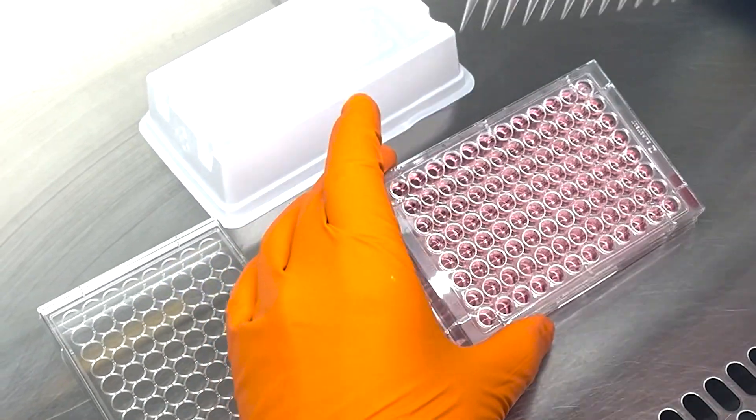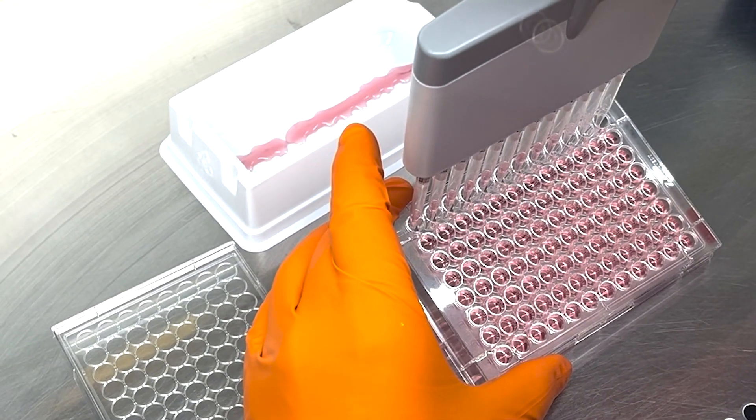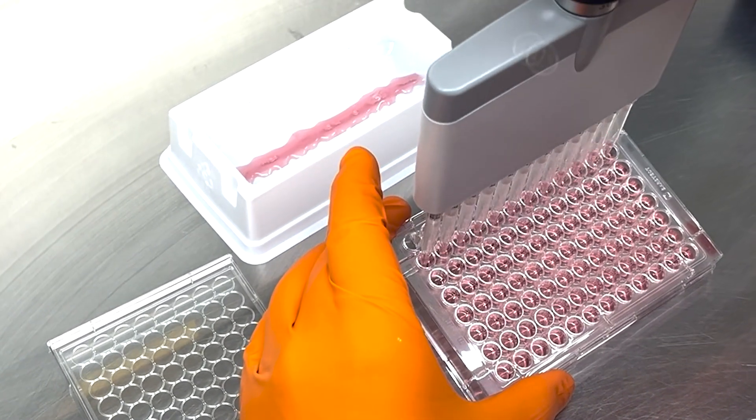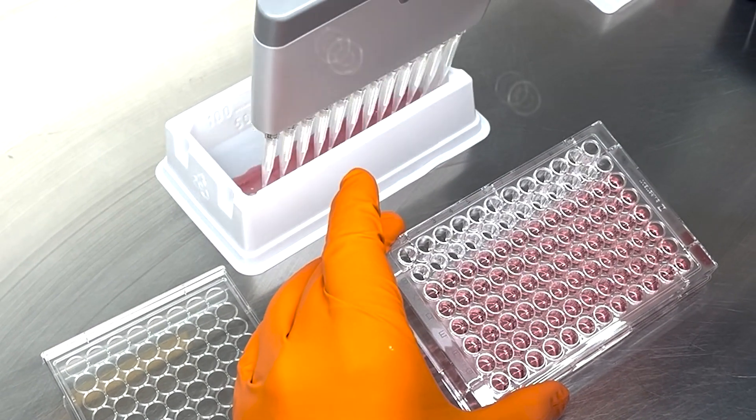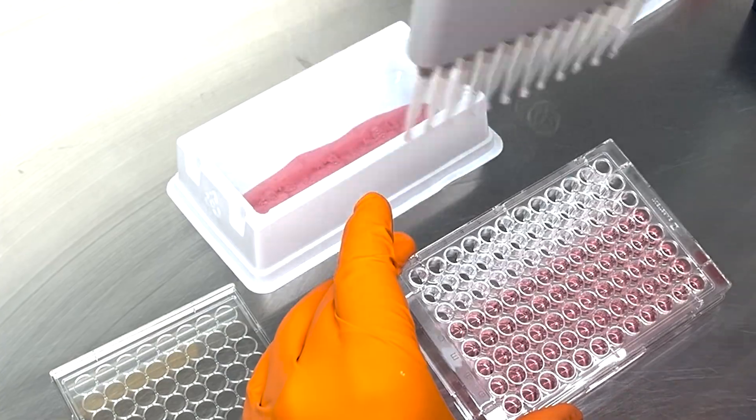First, we gently remove the media from the cells plate. Then, we need to fix the cells to the well of the plate to preserve their current state and stain them with crystal violet to properly visualize them.